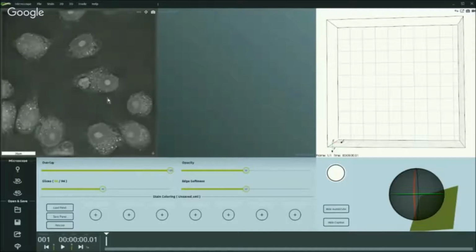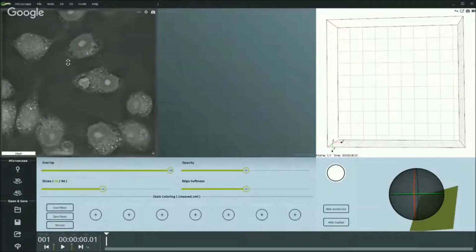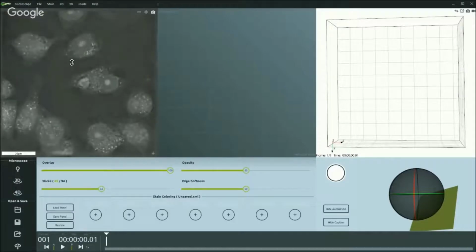You can already appreciate the detail. We can even zoom in, so we can see some vesicles, the nucleus, the Golgi, some membrane. And we can go down, down, down, until going out of the cells. Okay, so let's go step by step.